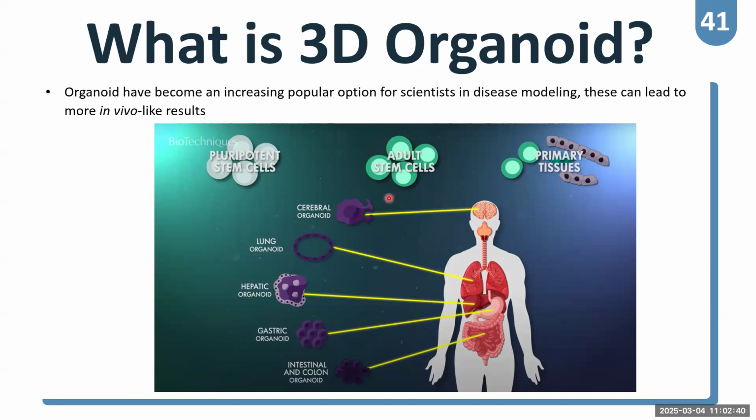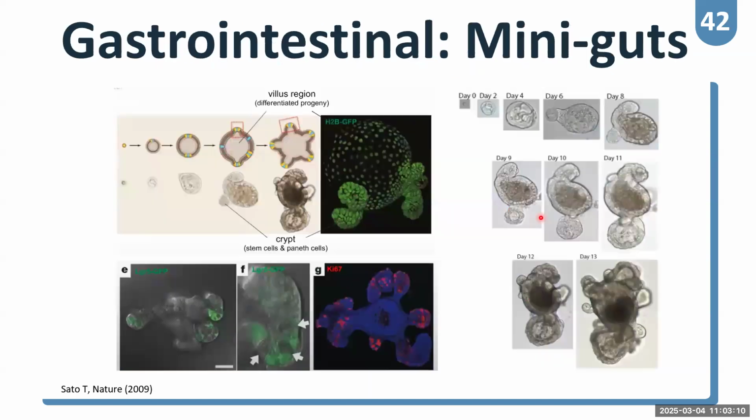But organoids can come from other sources, for example, pluripotent stem cells or adult stem cells, like Ajahn Methijit or Ajahn Pan deal with the stem cell. But for me, I have expertise to derive the organoid from the primary tissue of the patient. But finally, it's the same, that we try to generate the organoid to test for the patient.